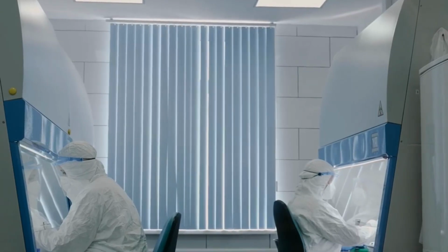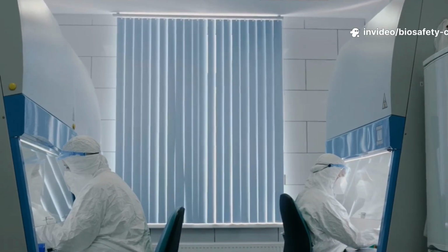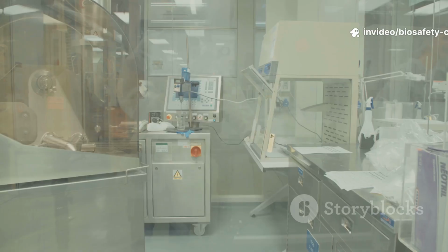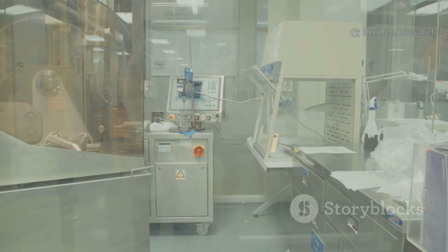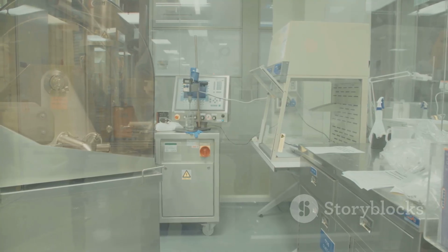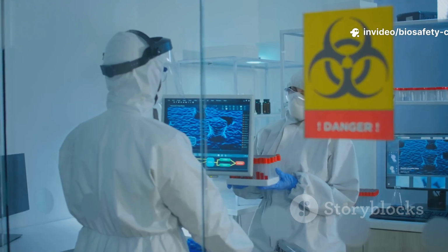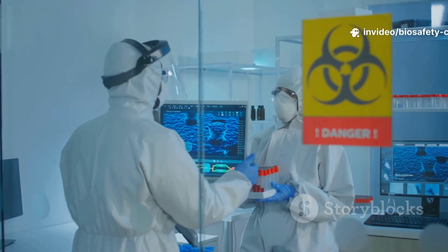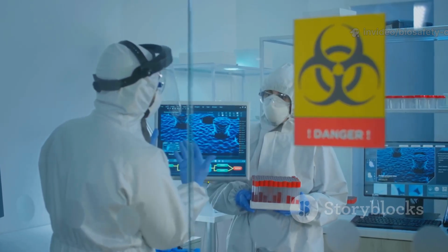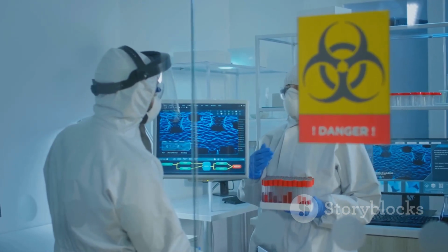Now, the big one, Class 3. This is the maximum security vault of biosafety cabinets, used for the most dangerous pathogens. Class 3 cabinets are totally sealed, glove box style, with double HEPA filters on both supply and exhaust. Nothing gets in or out unless it's been filtered or decontaminated. If you're working with the nastiest, most dangerous pathogens, think Ebola or high-level bioterror agents, this is where you're doing it. These are used in BSL-4 labs, which are as high security as it gets.